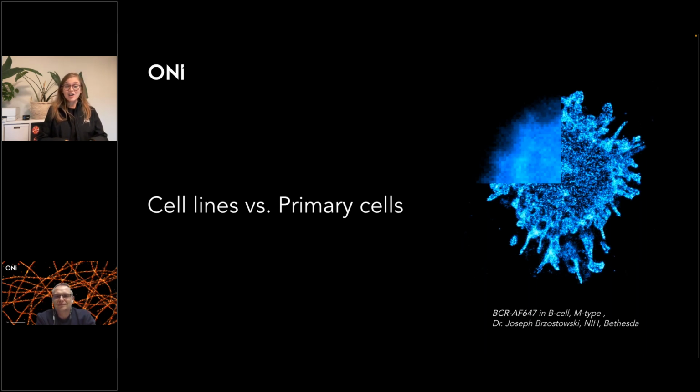And so we have our first audience question, regarding slides. The question goes: aren't most microscopes optimized for number 1.5 slides or cover slips? Yes, actually that will depend on your objective, basically, on your magnification.